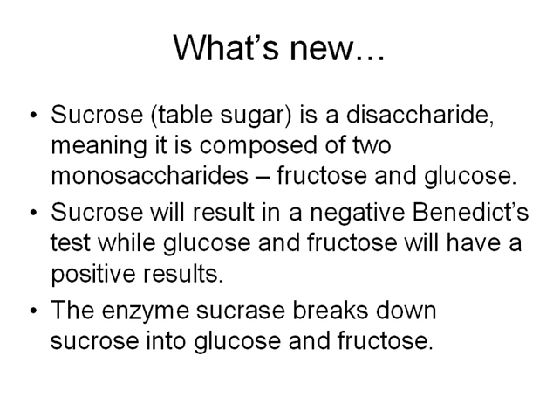Okay, and if we remember, a positive result for a Benedict's test is they turn orange when heat is applied. Okay? So, turns orange when heat's applied. That means it is a positive result.